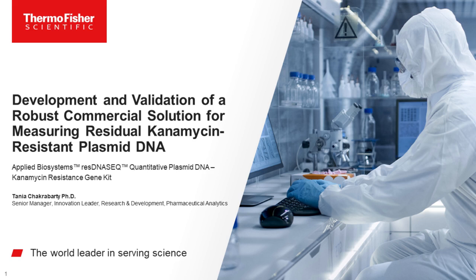Thank you for the introduction. Today, I will talk about the development and validation of a highly robust multiplex qPCR assay for the quantitation of residual plasmid DNA carrying Kanamycin resistance genes that are used in bioproduction and vaccine manufacturing workflows. The assay that I'm about to describe is important in ensuring patient safety and assurance of product quality in cGMP manufacturing workflows during lot release testing, or may be used during process development and optimization.